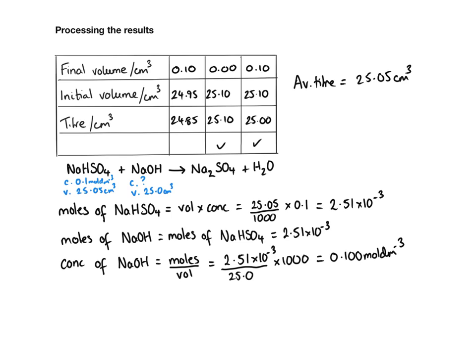Now, if this was a practical situation, you would go on and work out errors. In this video, we're just looking at the practical skills and the very basic calculations you would need to do at the end.